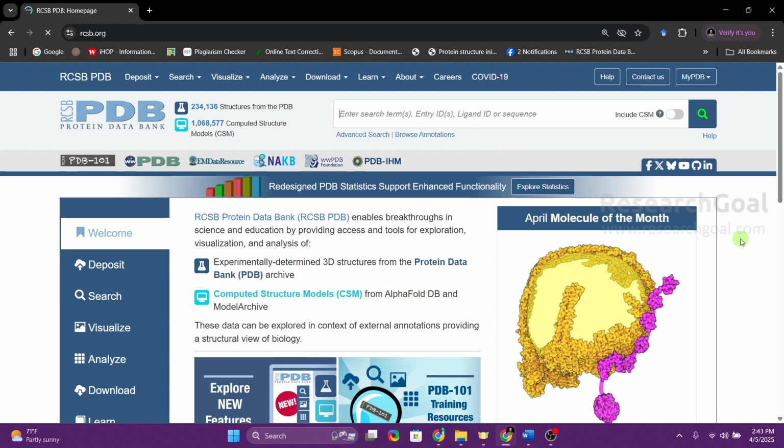There are different structures available, and different types of protein molecules that you can use. It depends upon what kind of docking you want to perform, right? So let me clear this. I'm going to show you molecular docking with one particular example, specifically containing a bacterial protein. If you have your own protein and your own ligand molecule, you can follow the same process, but it might be a little bit different. All the data that I'm going to use might be different. For example, the protein ID will be different and the active site will be different, so you have to find that out.